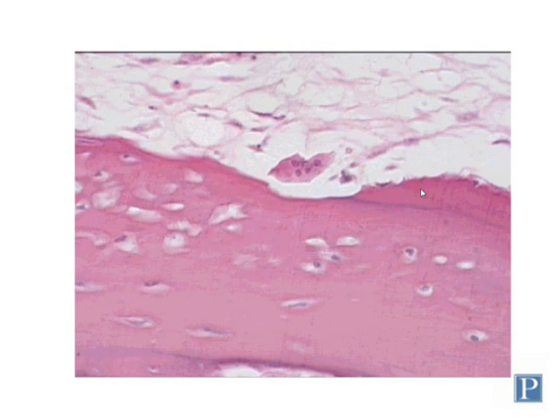There is a third type of bone cell which you need to know and be able to identify, and that's called an osteoclast. This cell right here is an osteoclast, and as you can see, it has quite a bit of a different shape from osteocytes and osteoblasts. Osteoclasts are much larger than the other two cell types.